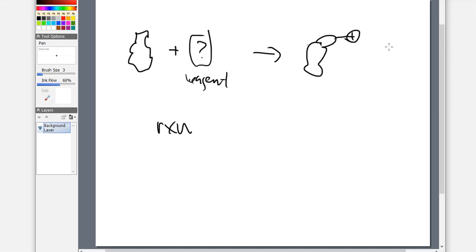So a reaction is going to happen, and a lot of times we need some type of catalyst for this reaction to happen, and many times it is something as simple as heat. So I'm going to add a reagent onto the surface of a plate. That reagent is going to come in contact with the components that is on the plate. I'm then probably going to heat it in some form or fashion. It's not a requirement every single time, but it's very common.